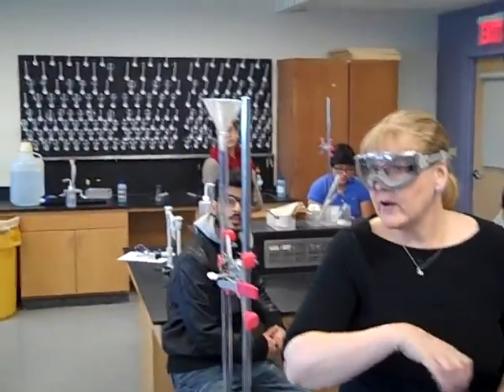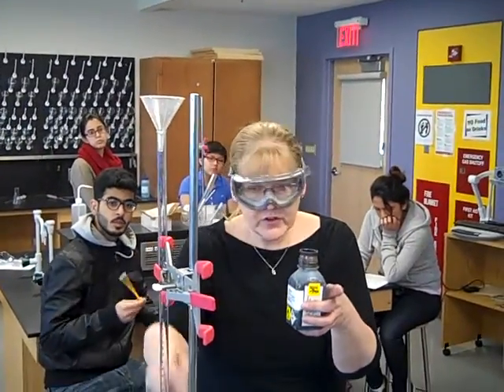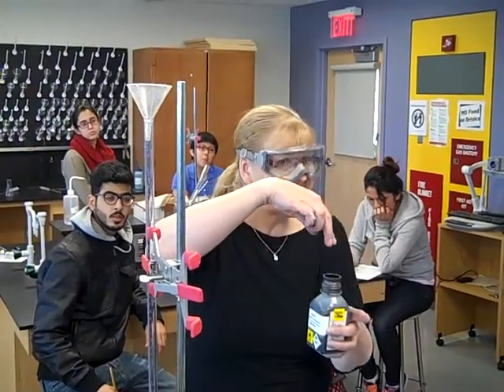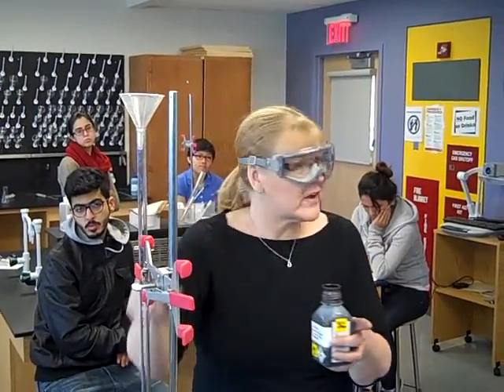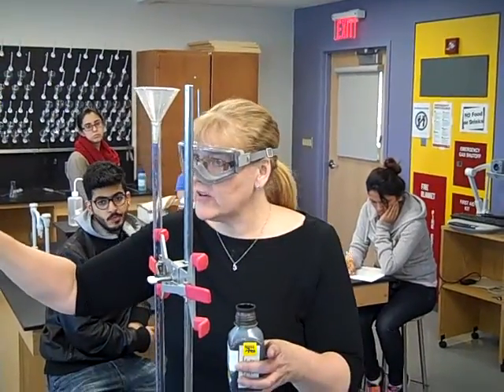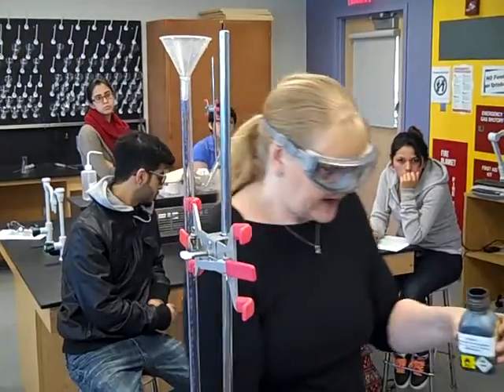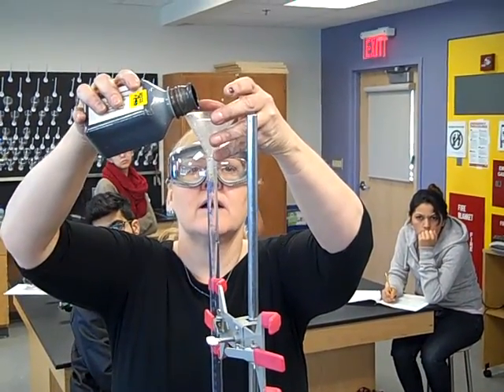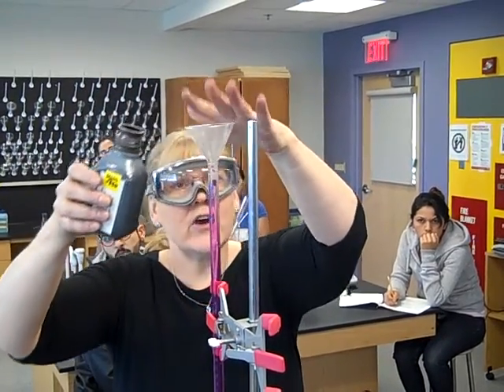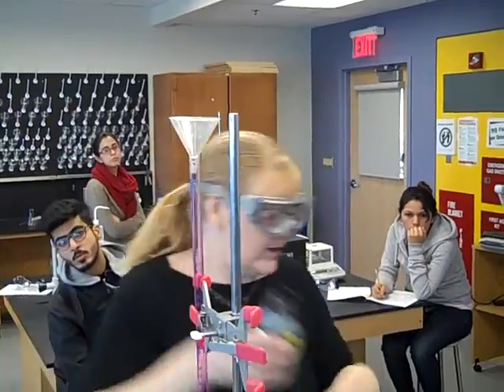Do not share your permanganate. At the end of the experiment, you're going to take whatever was in your burette and pour it back into the permanganate. We don't want to pour it down the sink, which means that the concentrations may vary container to container. Don't share your permanganate container. I'm going to add just a little bit of my permanganate. I'm lifting up the funnel because if I don't, sometimes it can kind of seal, and if it seals, it can just bubble right over.